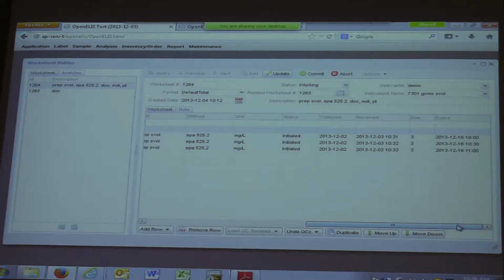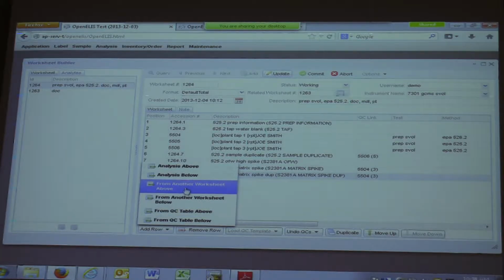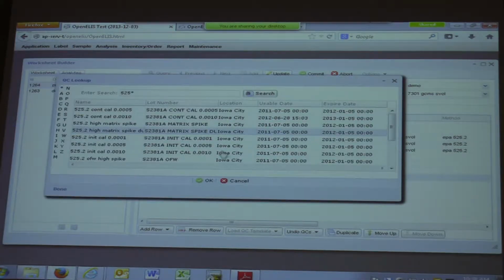Is the fix then going to automatically renumber them, or only renumber once you hit commit? I'm thinking. If I do it right, it'll do it automatically. It'll do it right away. Thanks, Lester. Good question. It will, of course, always do it on commit.